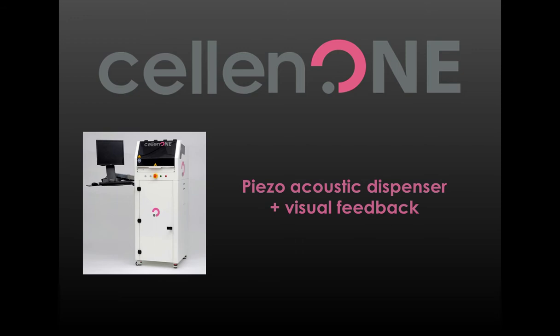So with the piezo dispensing, that's what we incorporated into the CellenONE, and now you'll be able to see some of the hardware and the software features that we use in our core technology and how we're enabling it for just single cell dispensing. So Guilhem, I'll give this back to you for the next segment.